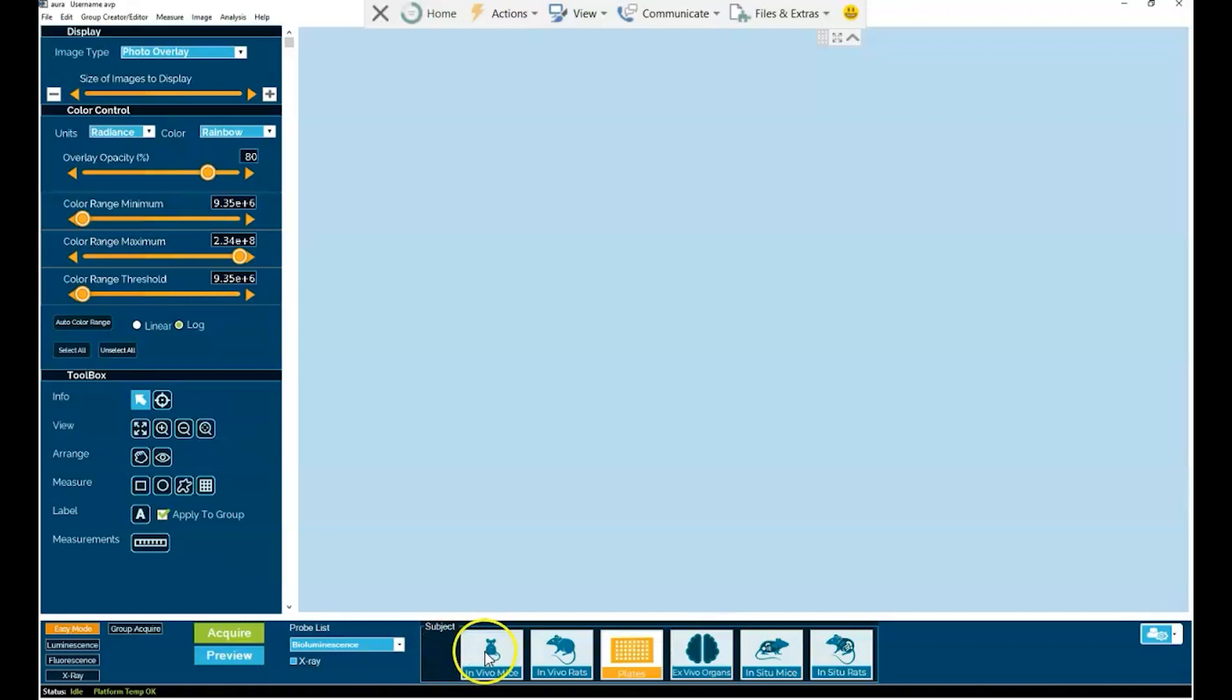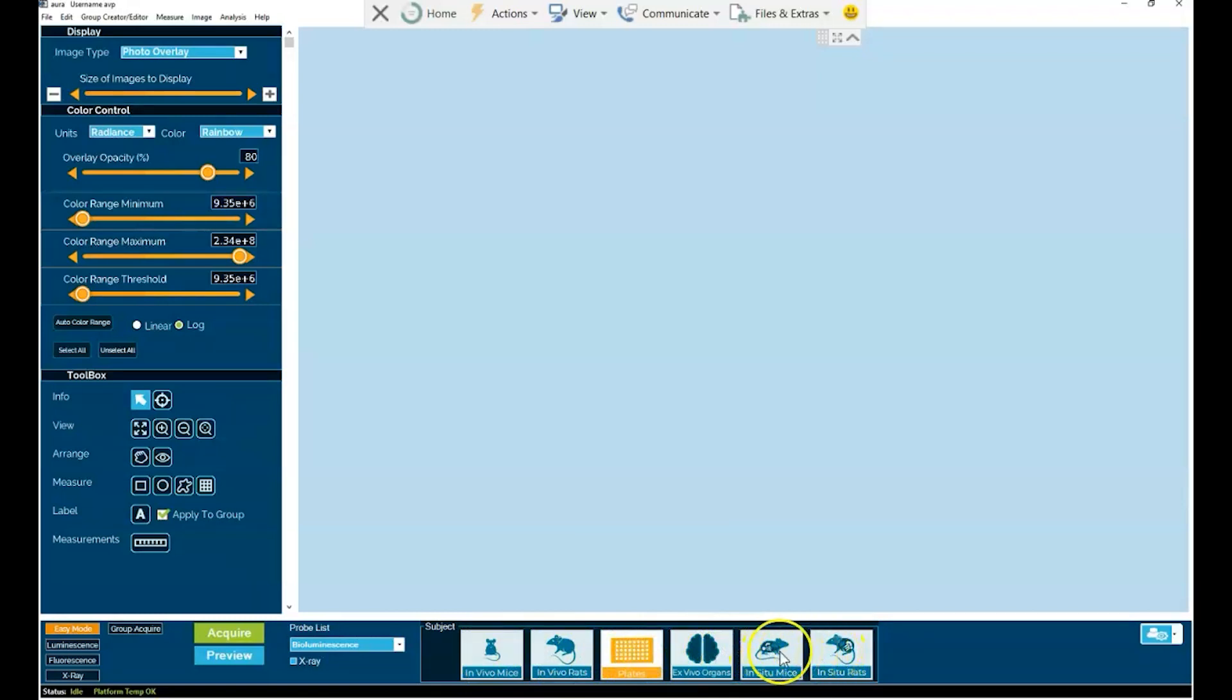One is your subject type, be it mouse, rat, plates, ex vivo, organs, or in situ imaging of a mouse or rat.